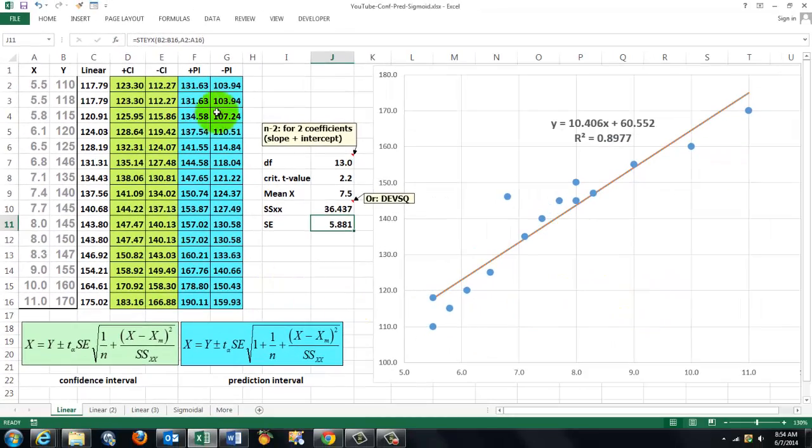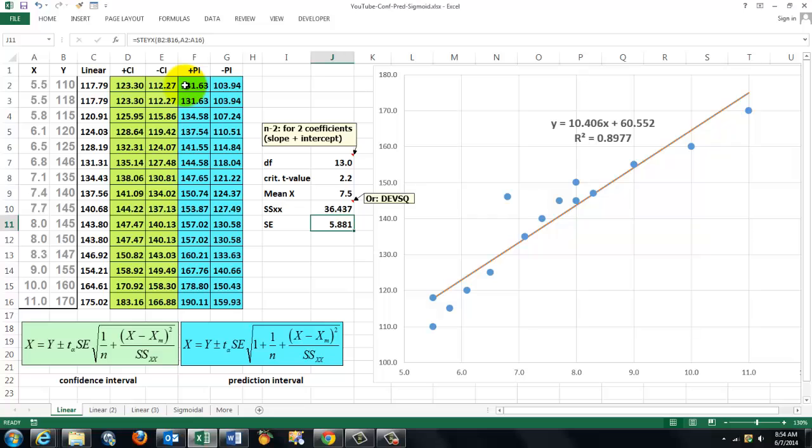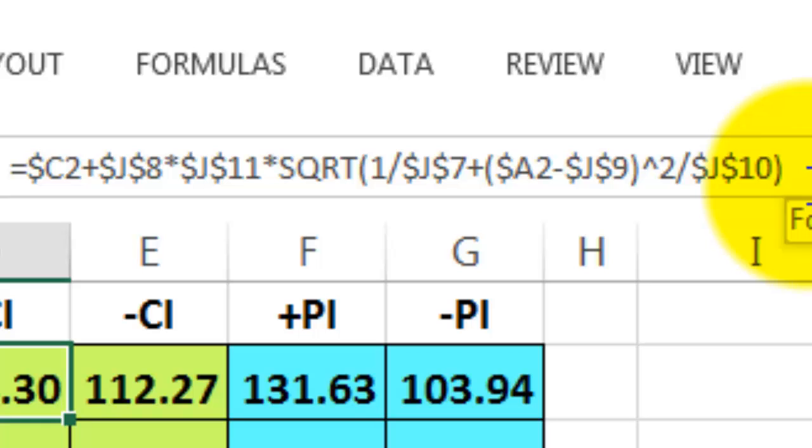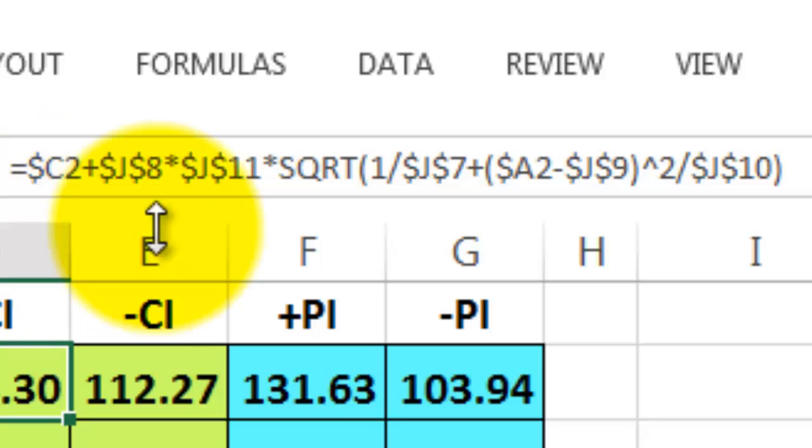Once we have those values, we are going to use this equation in column D and column E. In D plus everything and in E minus. So here is the formula we are using. Notice that I used a lot of string signs, or maybe you call them dollar signs, but it's a string sign that locks sometimes the column indicator, sometimes the row indicator. Why did I do that? So I can copy the formula down and I can copy it way to the right. All I have to do then is adjust the formula very easily.